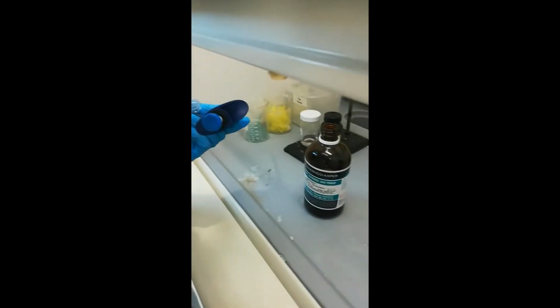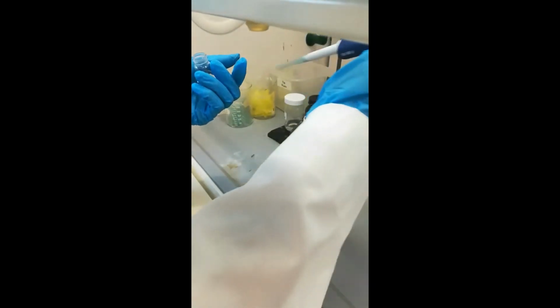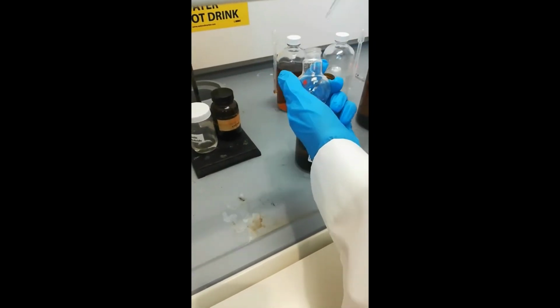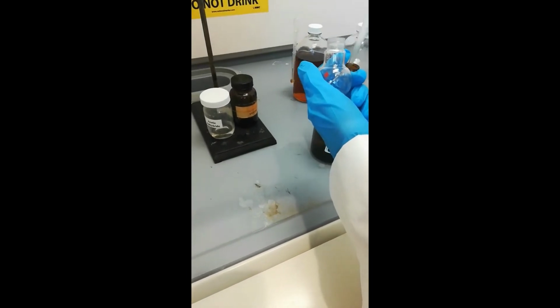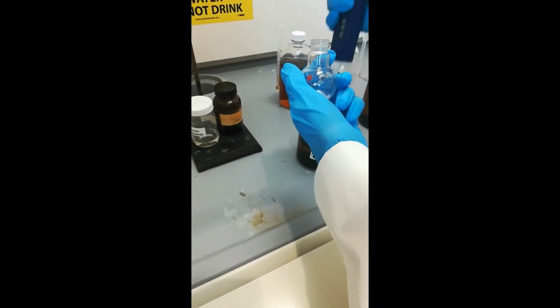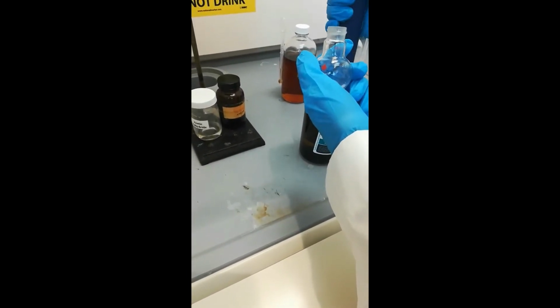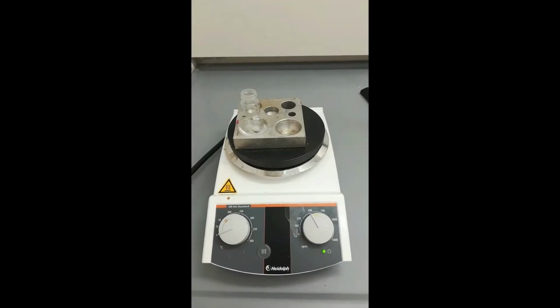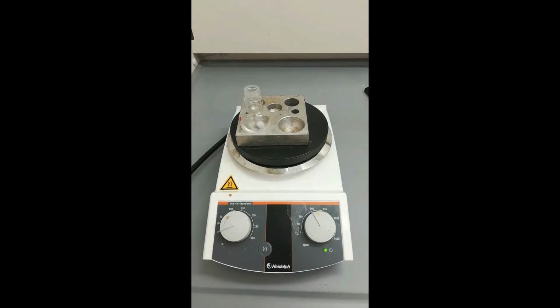Next, we will measure 5 ml of ethanol, and we will do this using a mechanical pipette, since we need to be pretty precise about this one. The ethanol we are adding is absolute ethanol. Then we let the round bottom flask sit on the magnetic stirrer. As you can see, the heat is switched off.